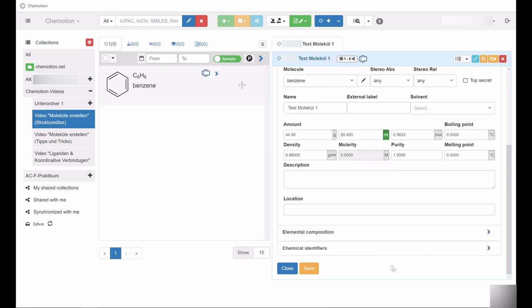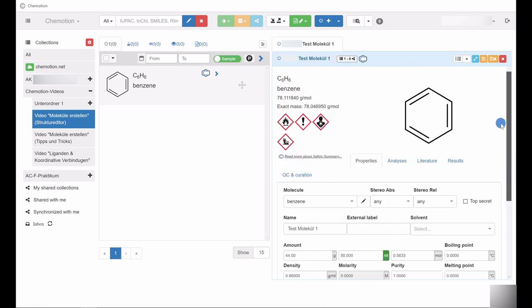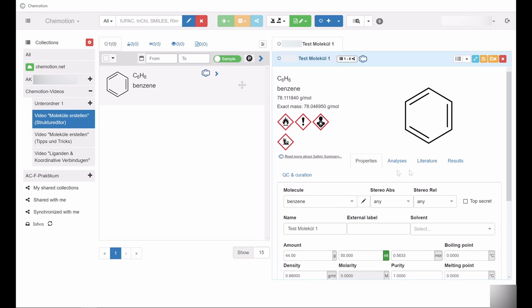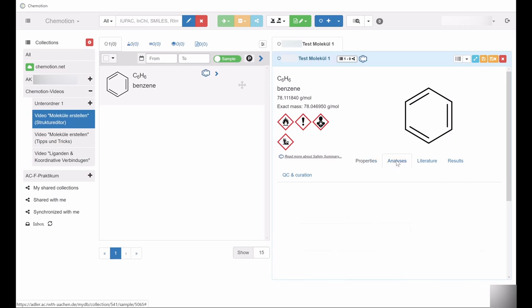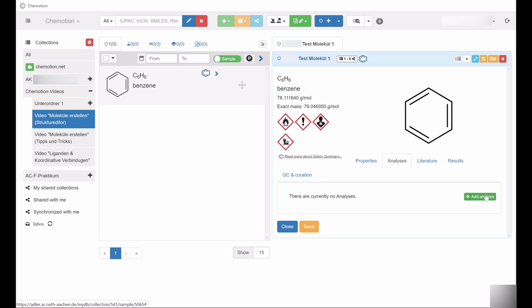The tabs just underneath the drawing area not only provide access to the properties of the compound, but also to analytical data such as NMR spectra. A separate video will demonstrate how to include analytical data in a sample entry.